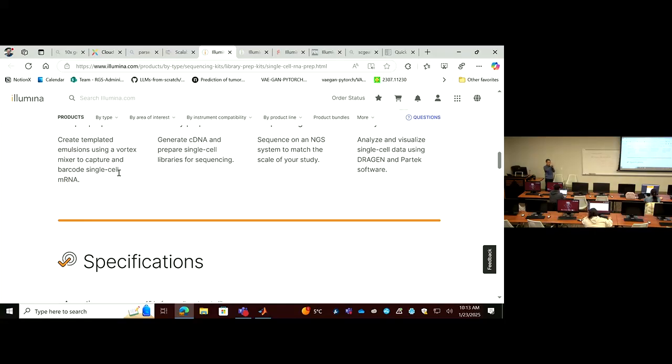So you map this to the genome by looking at the DNA sequence and finding the consensus fragment, and you map that to the corresponding gene. If there are many reads mapped to the same gene, that gene's expression level is relatively higher than others.